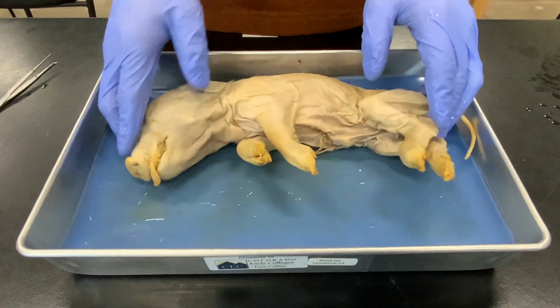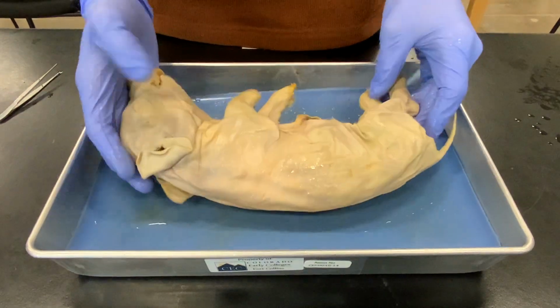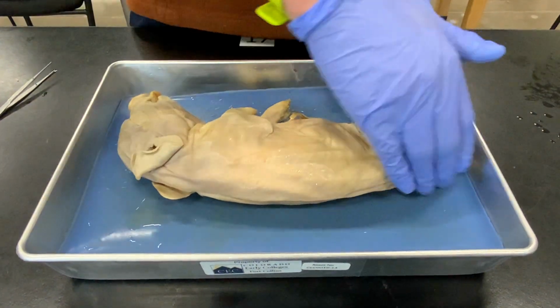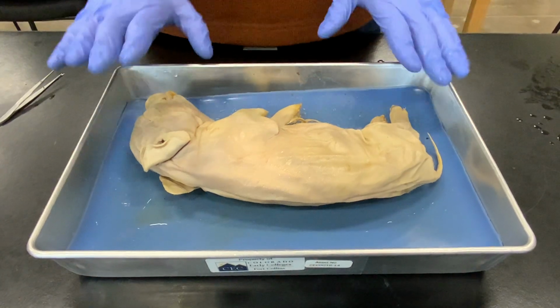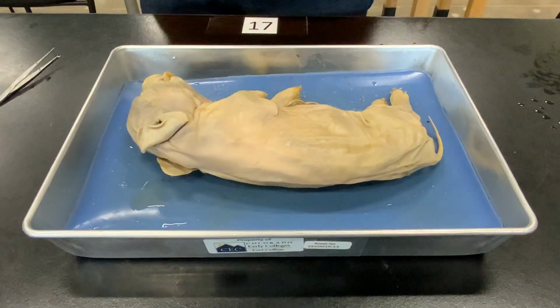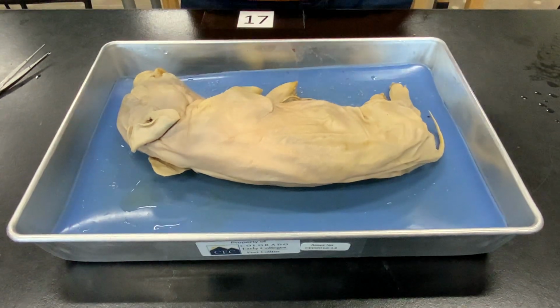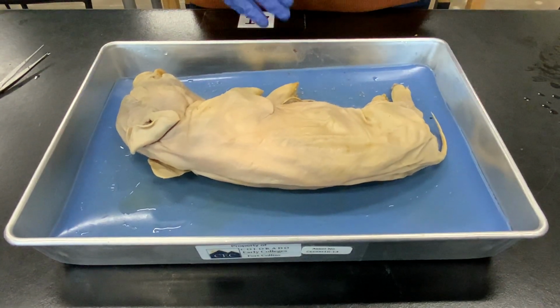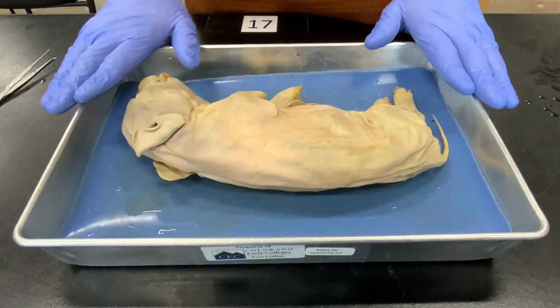All right, we are going to now dissect a pig, which is another vertebrate animal. This is the dorsal side here and ventral side here. This is going to be slightly different because it has a different diet than the frog and a different metabolism. So the size of the organs might be a little bit different, and it's also a mammal. So we'll point out some differences as we get to them.